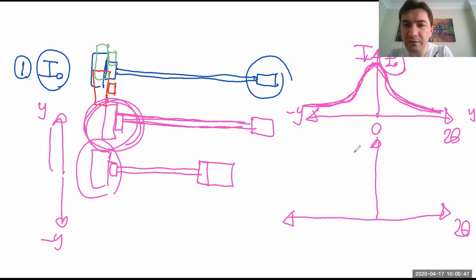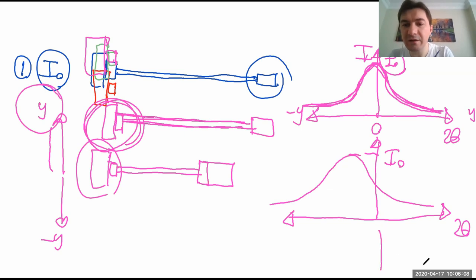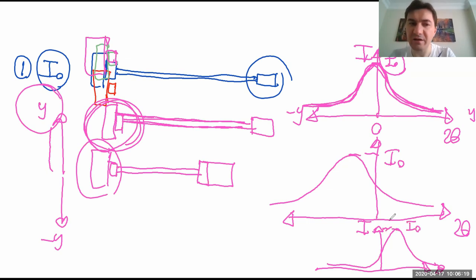Theta again, now you have this type of signal. This is the direct intensity. So if the detector is staying at that position, a little bit up in the positive direction, then you can see such a signal. This is the intensity, this is the 2-theta again, now you have such a signal. This is the I0, maximum intensity.